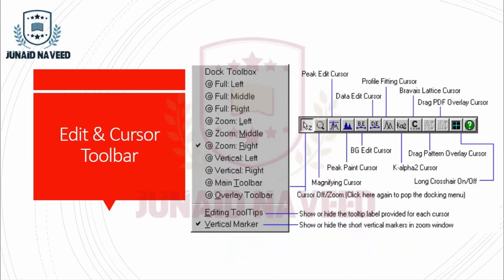Today is the fifth lecture of Module 1: Shared User Interface, and today we are discussing the Edit and Cursor Toolbar.